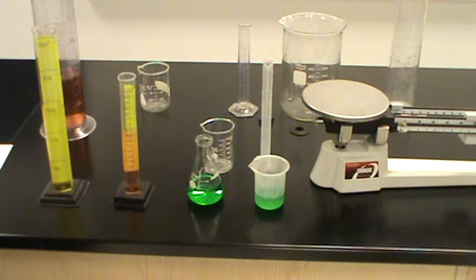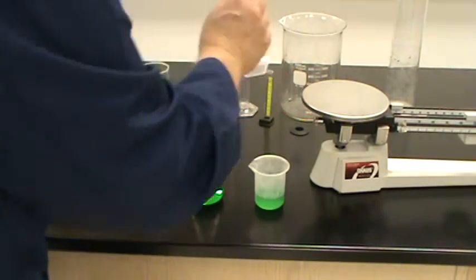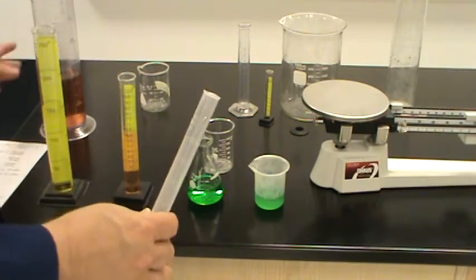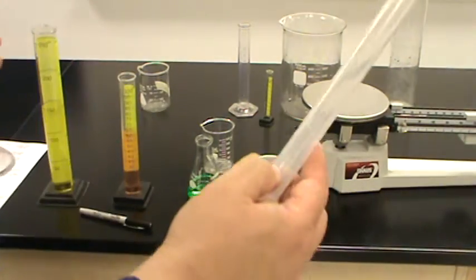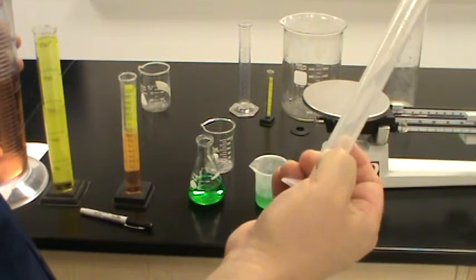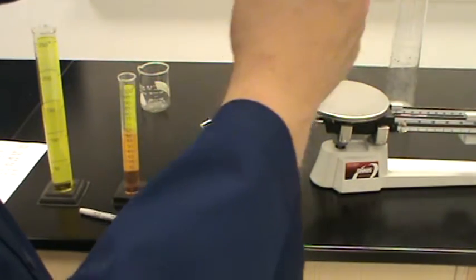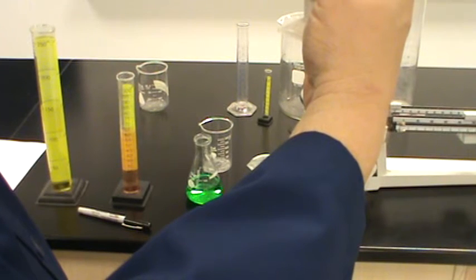I then asked you to do some specific measurements where you actually poured liquid into a container. In this case, into the plastic graduated container. The first one I asked you to do was to measure 5 milliliters. Well, to do that, we have to find 5 milliliters. And in the plastic it's right there above my thumb. It says 5. So, being very gentle, we're going to see if we can measure.